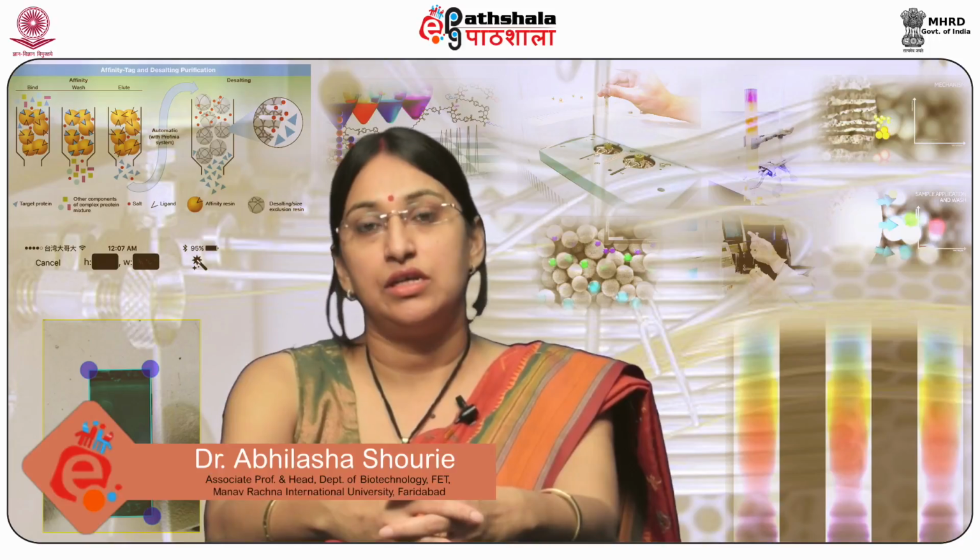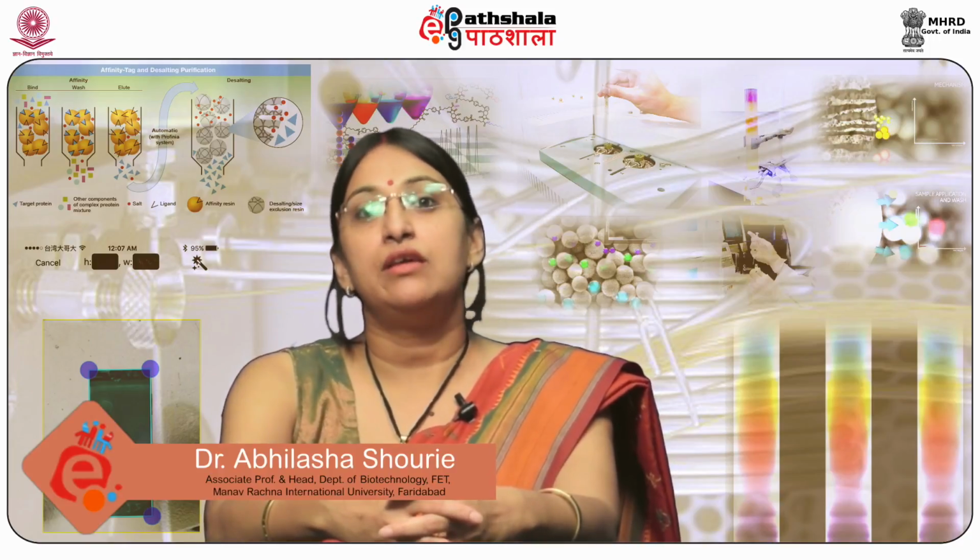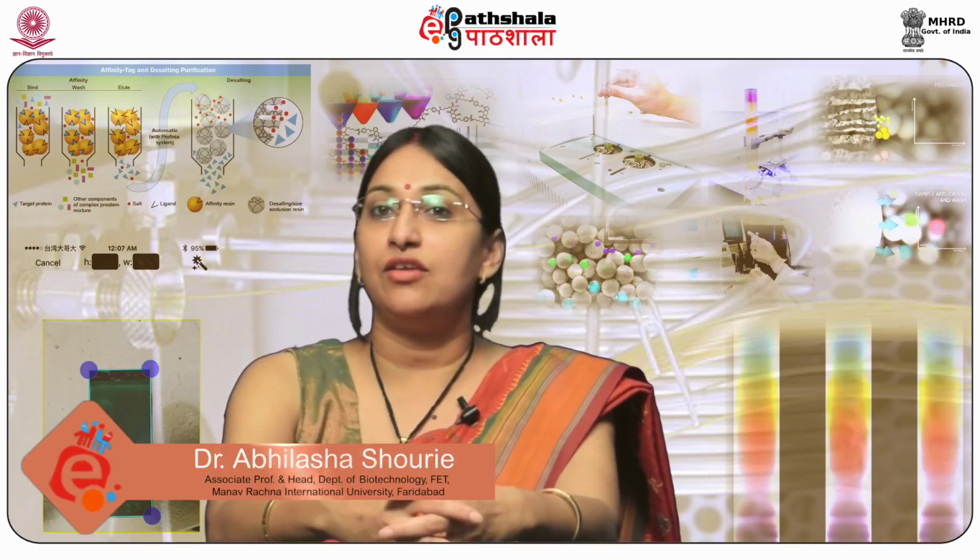So students, let's now summarize what we have learnt in this module. The chromatographic techniques can be applied to separate a large number of organic and inorganic compounds with great efficiency. The separations depend upon the nature of the analytes to be separated. Selection of an appropriate combination of stationary phase, mobile phase and other conditions is mandatory for efficient separation.